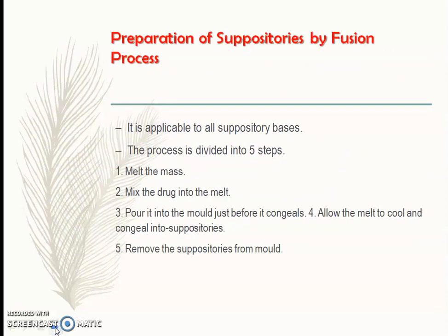Then preparation of suppository by fusion process. This is the second method for the preparation of suppository, which is known as the fusion method. It is applicable to all suppository bases. This process is divided into 5 steps.